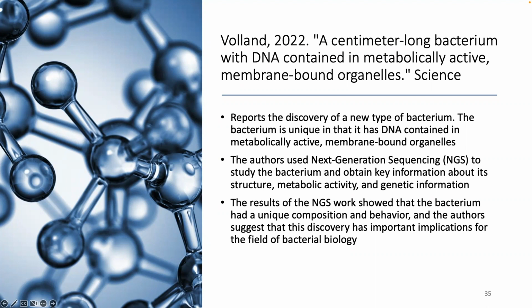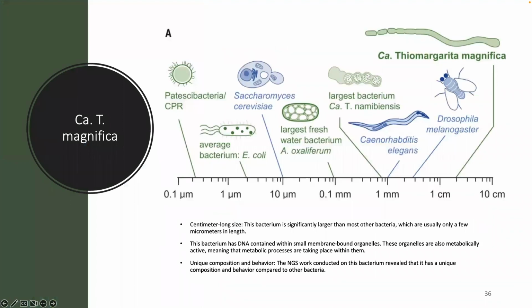Now, this bacteria is a large sulfur bacteria. We're going to go into the next slide. This bacteria is a large sulfur bacteria, and there are many that have been classified and there are reference genomes available for related species. So now we wanted to compare this new species with what we know. The researchers made the interesting findings and then basically went on to pick an approach that would best meet their needs to interrogate the genome without bias towards one type of sequence through amplification or another. They wanted to look at everything.